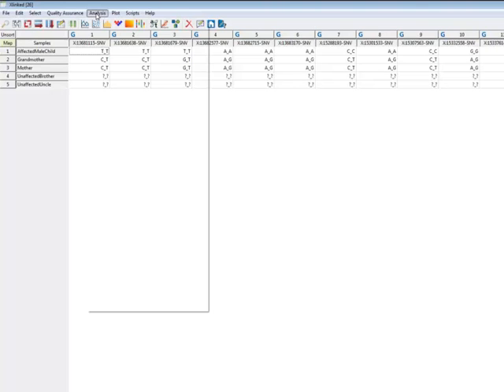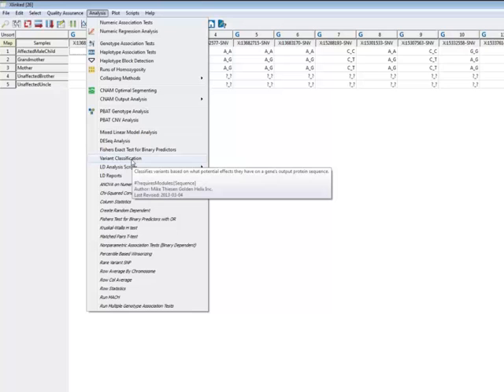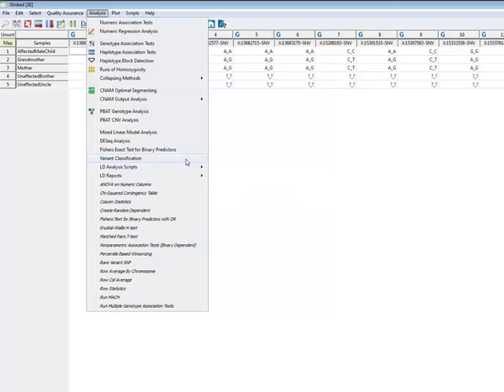And I'll start here, and I know I'm going really fast. You don't need to worry about copying down all these steps. I'm just trying to demonstrate a workflow so we can all get our heads into the analysis game before we start hearing from some of our other guest speakers and different analysis projects.